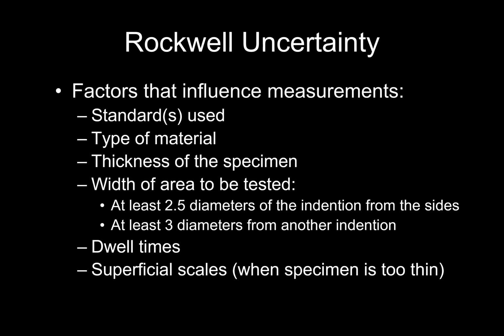So of course, one inconvenience with this Rockwell technique is it produces a relatively large uncertainty. There are different factors that influence the measurement. For instance, the standards that are used, the type of material you are testing. So some Rockwell hardness tips will not work well with certain materials.